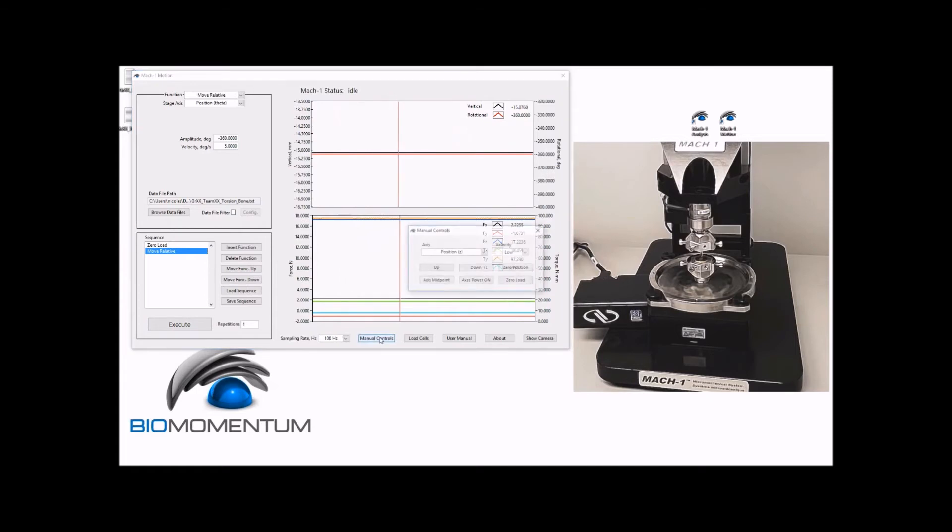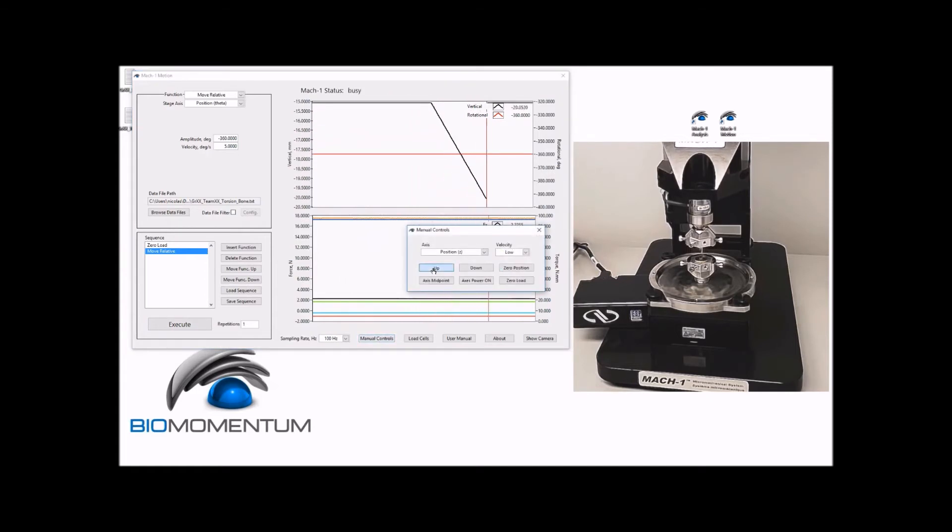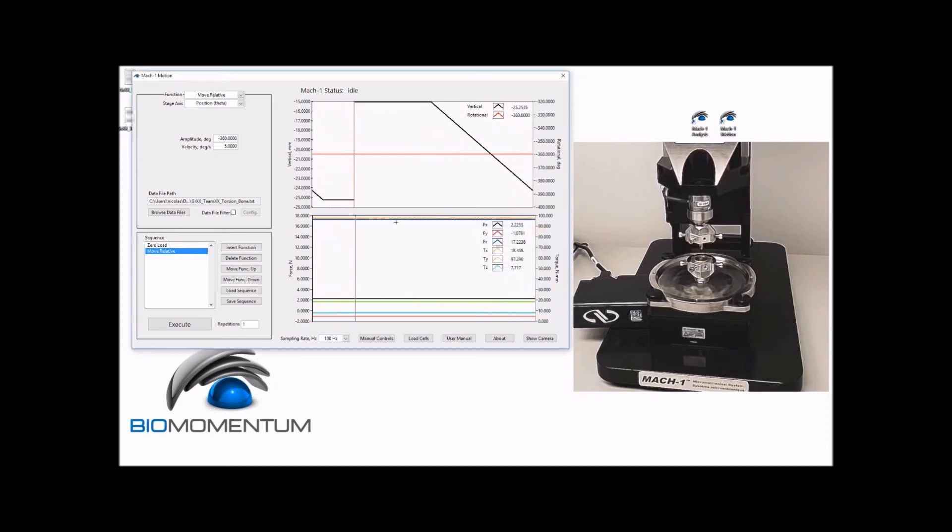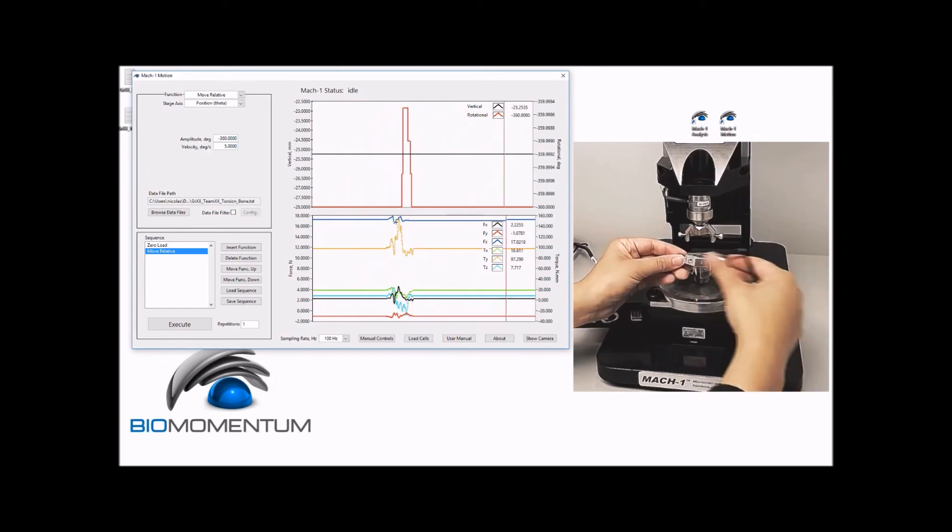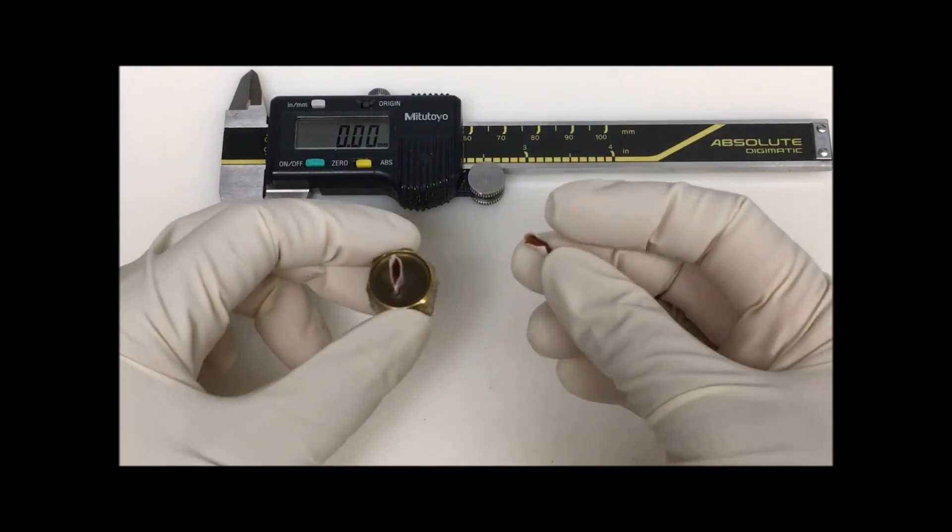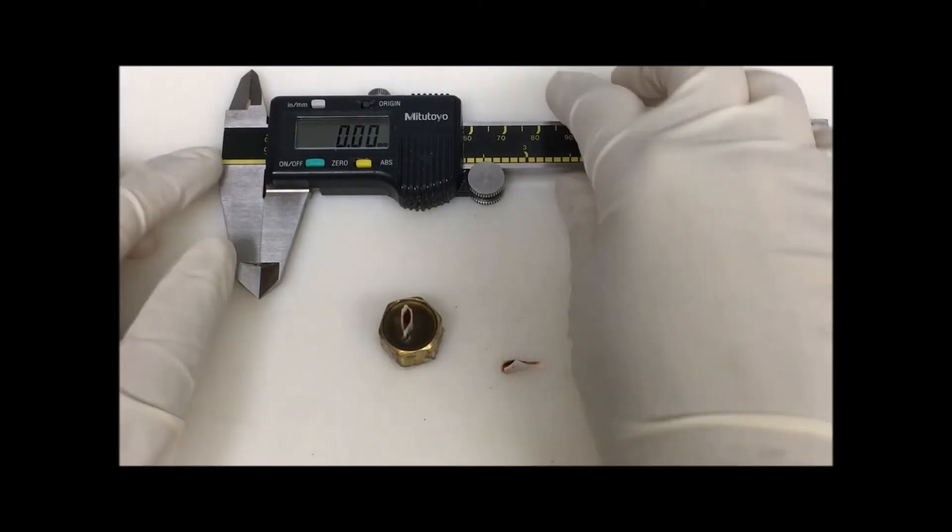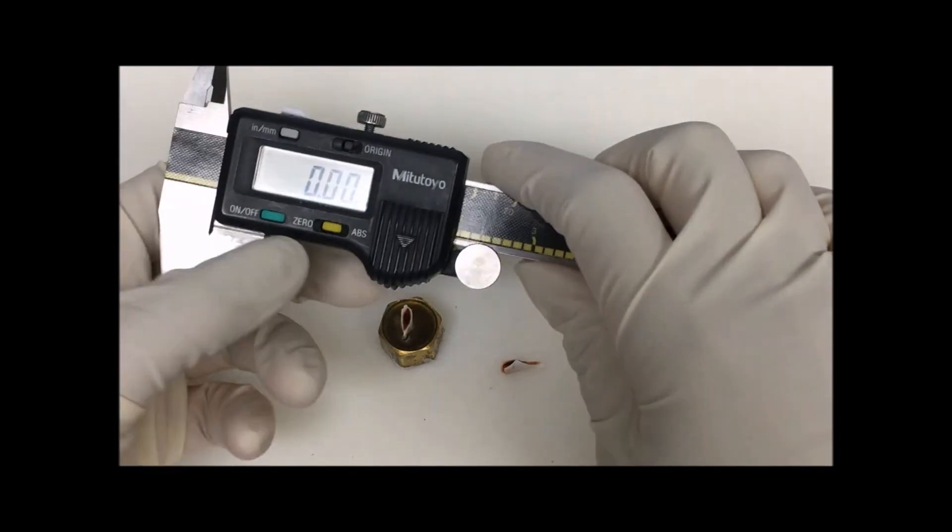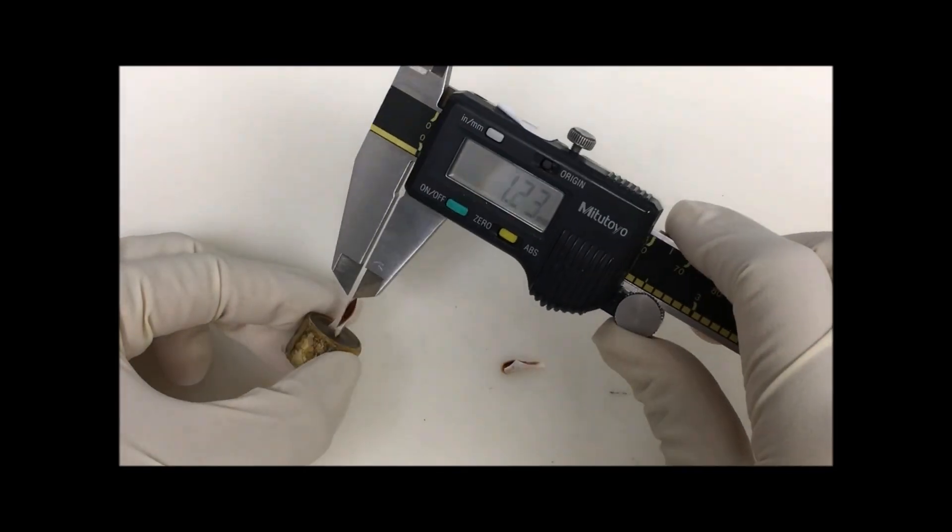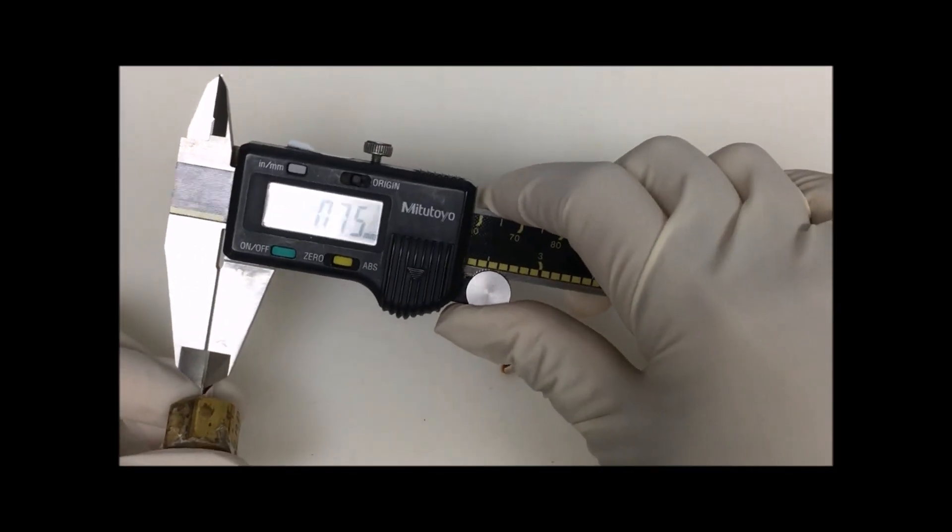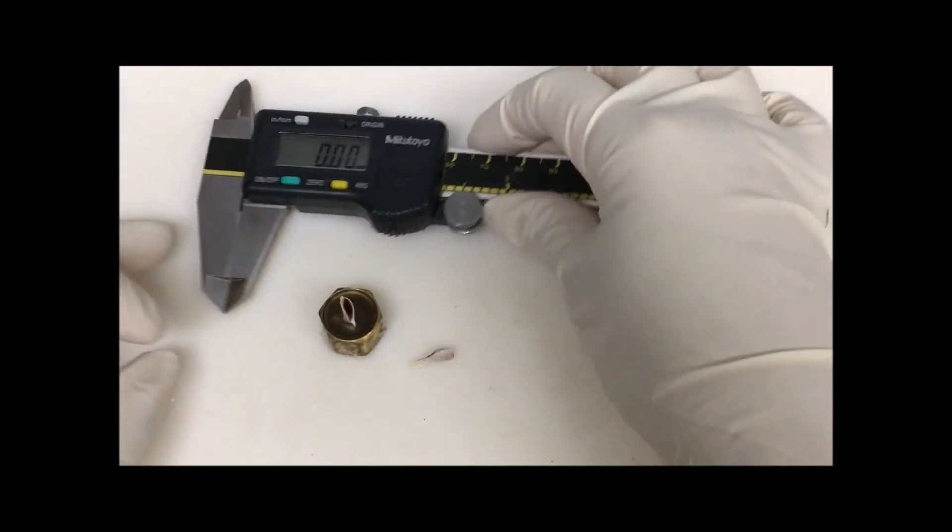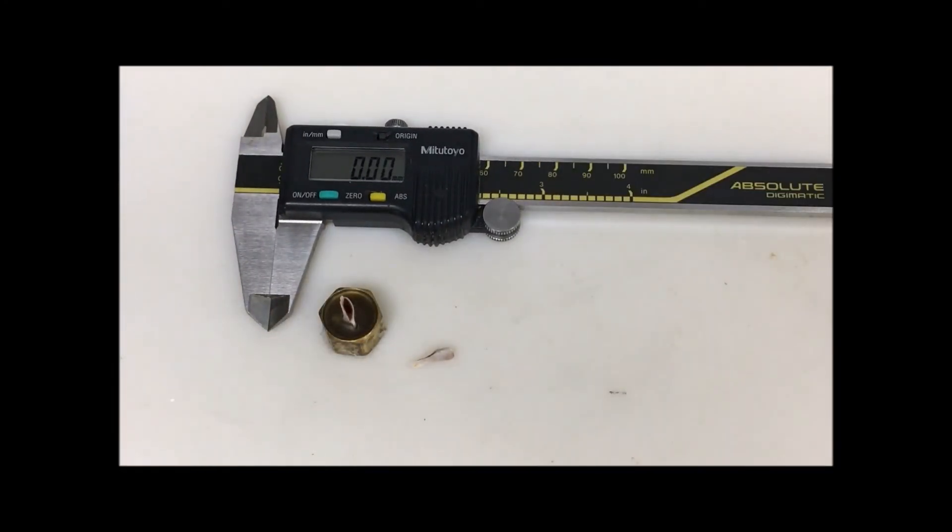Now that the torsion test is done, using the manual controls, raise the vertical stage at medium speed and unscrew the torsion adapters from the torsion base. Using a caliper, measure the wall thickness of the cortical bone after the femur has experienced failure and report the value. Then dispose of the sample.